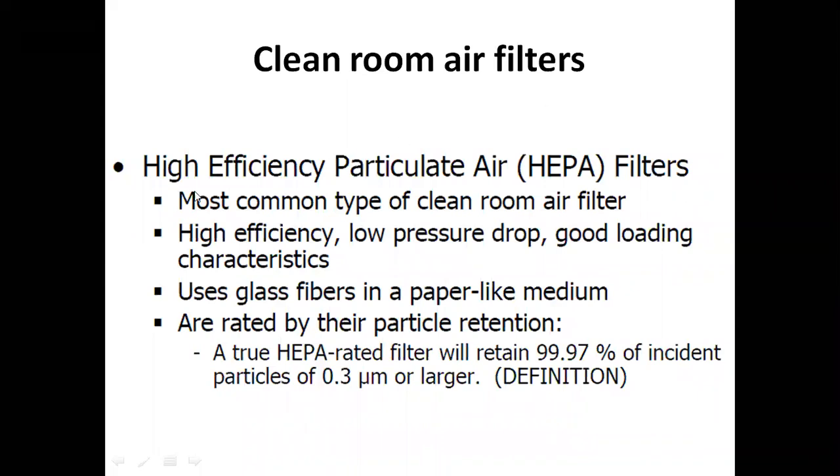Clean room air filters: high efficiency particulate air filters, HEPA. HEPA stands for high efficiency particulate air filter. Most common type of clean room air filter. High efficiency, low pressure drop, good loading characteristics. Uses glass fiber in a paper-like medium. We are making filters, and how that filter is made, they use glass fibers which are randomly oriented in a paper-like medium to make these filters.